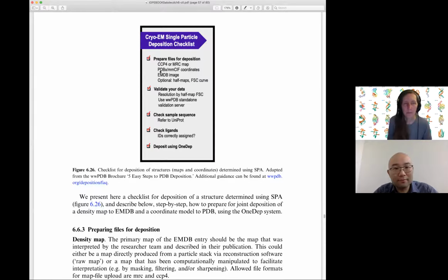The most important thing we really want to know is your resolution, because it lets us rank the structures in some ways.